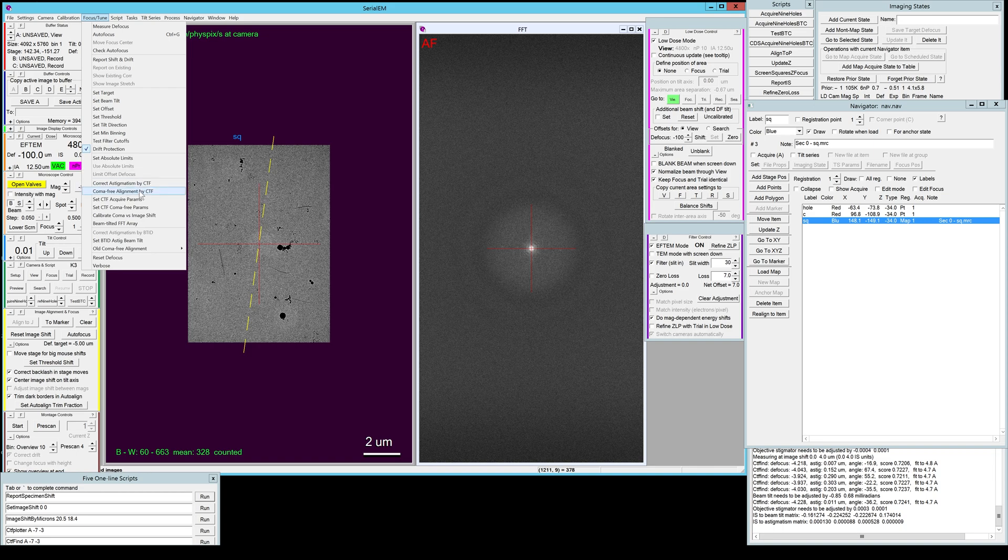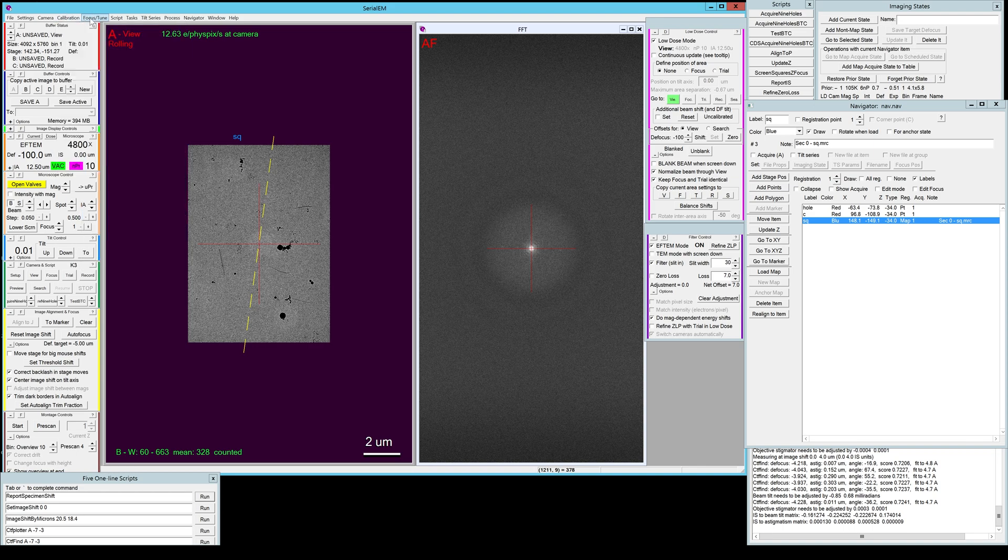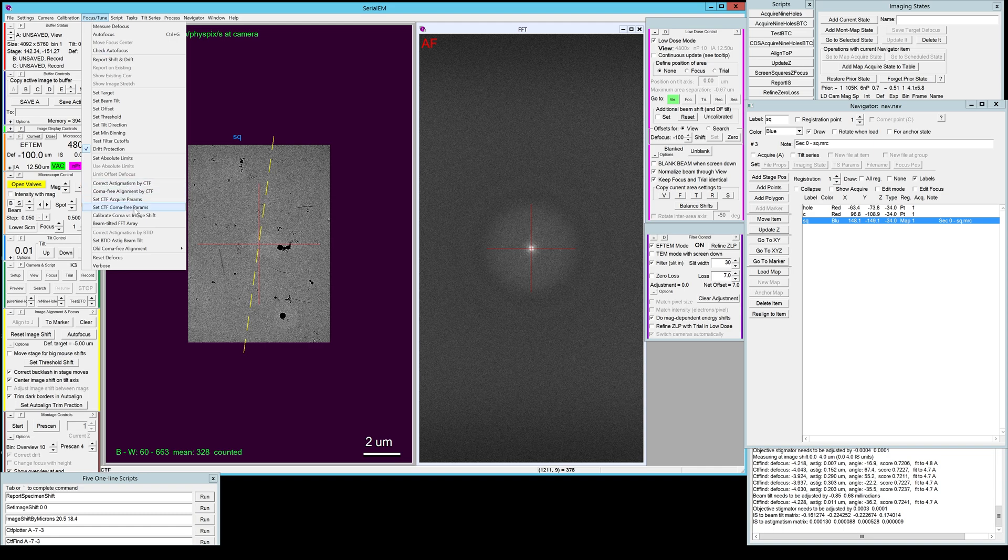Including, if we go up here, the coma-free alignment by CTF and SerialEM, and also the calibrate coma versus image shift. This has been moved in SerialEM 4.1 from the calibration menu to the focus tune menu just in case you're looking for it. This is important to keep the beam tilt minimal for large image shifts like you would usually use if you collect tilt series in parallel.